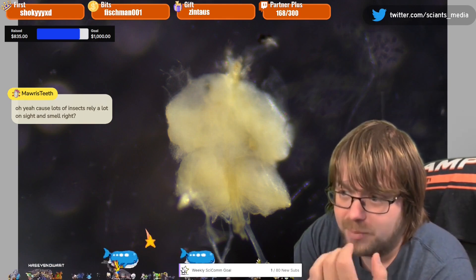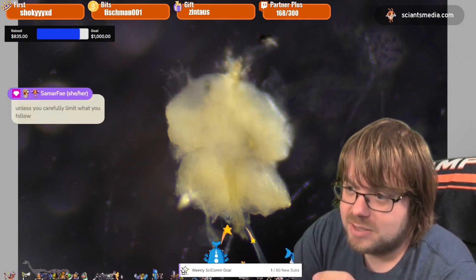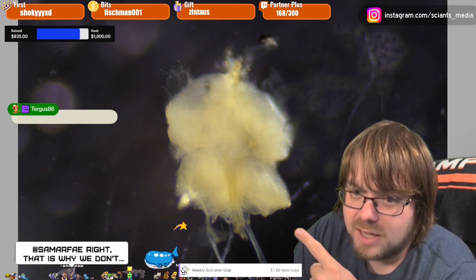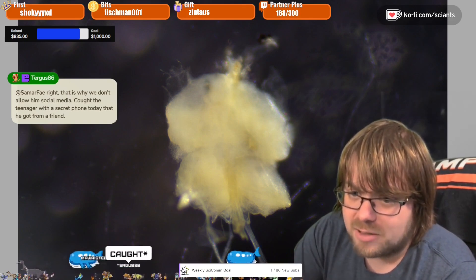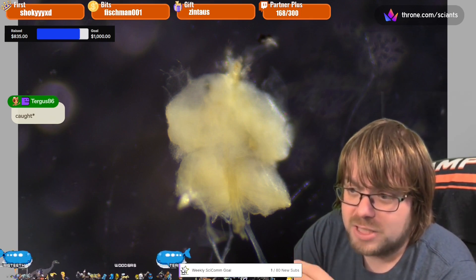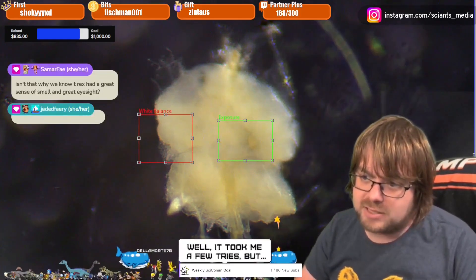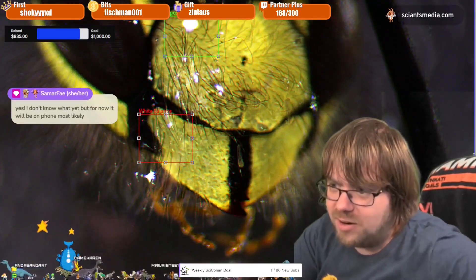What's really cool is that if you look at the brain of an insect, you can detect what its primary senses are. The antenna lobes are huge, so smell is probably very important to this animal. The optic lobes - I ripped them - but if you could see a large optic lobe you'd know there's a lot of visual information being processed. Really small optic lobes mean far less reliance on the visual system. One zone that's commonly enlarged in social insects is the mushroom body - that's the learning and memory center of the brain, located up here.